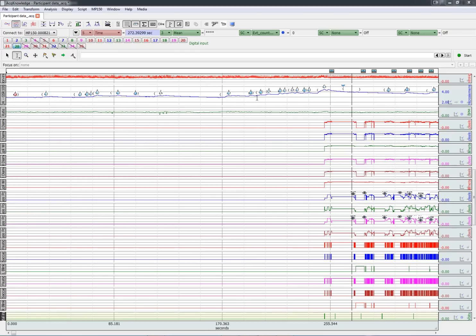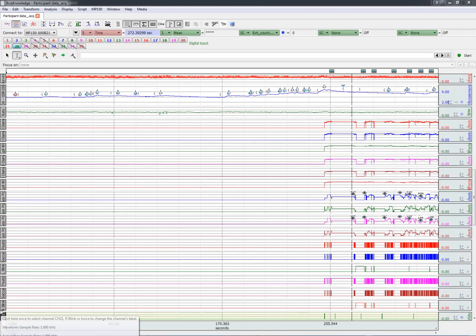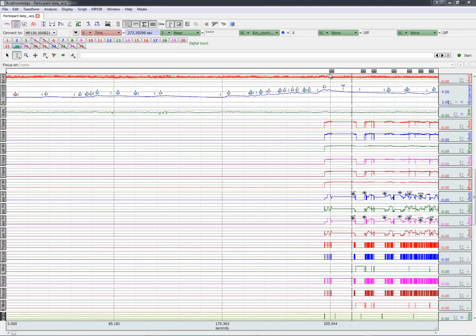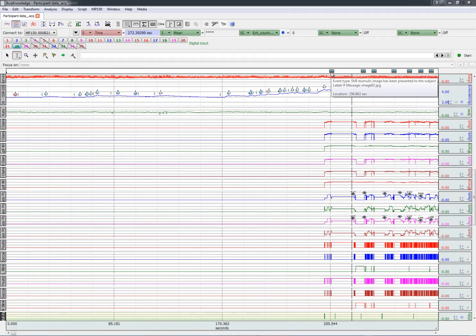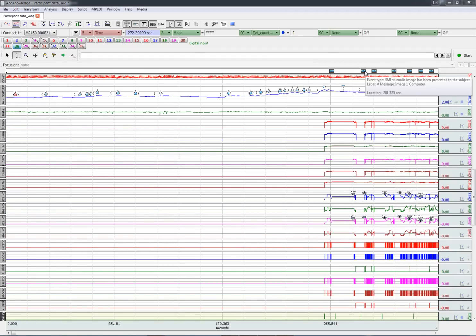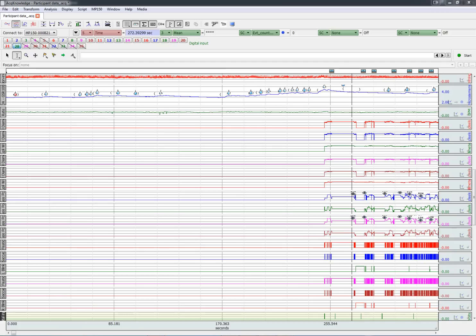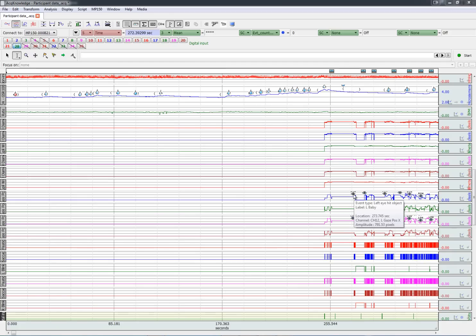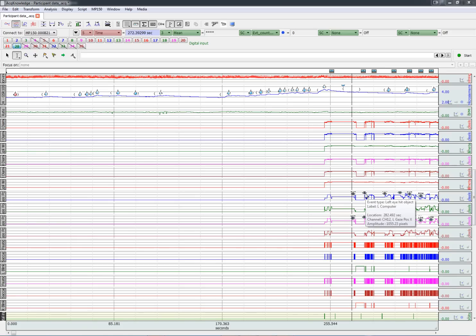And now we have all the new channels from the eye tracking import, as well as markers. They represent when each stimulus image has been presented. And furthermore, we have other markers that show us when we have looked at specific target areas. In this case, we've looked at a photograph of a computer.